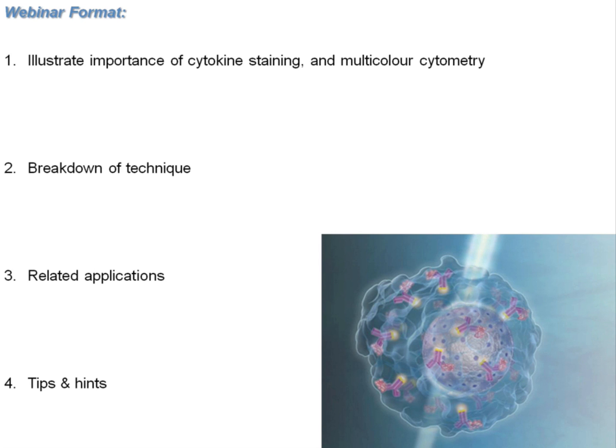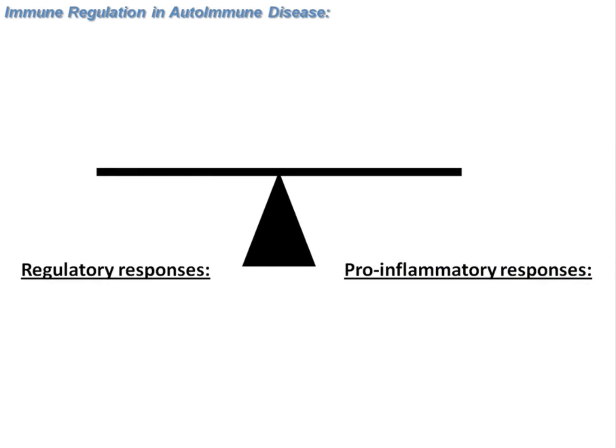Also, I'd like to go through a little bit of the breakdown of the technique and some of the various aspects that relate to it. Then also some of the complementary techniques that tend to be allied to cytokine staining. And then towards the end, some tips and hints that I've accrued that may help you along with some of your work.